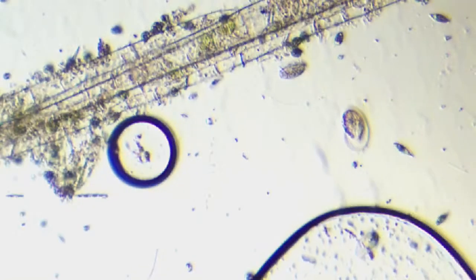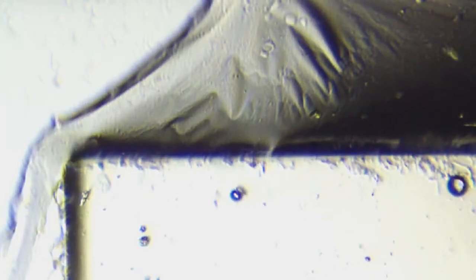The slide starts to dry up. Let's go to the extreme edges and see what we can find. There's some more crystal forming. Look at that. It's getting all thick. So a lot of the action's centered around these debris clusters mostly. Some independent ones swimming around, but a lot of the good stuff is like these little micro forest things, which is just clusters of debris where things like to hang out.